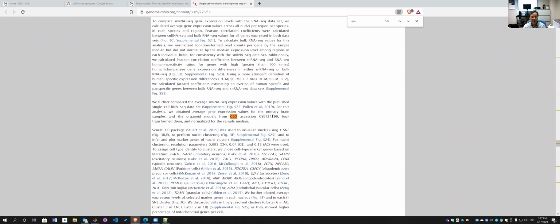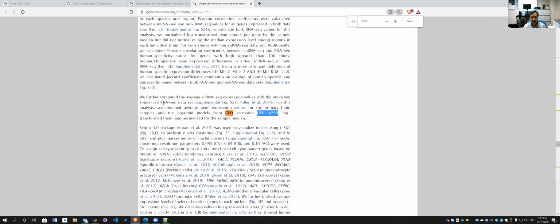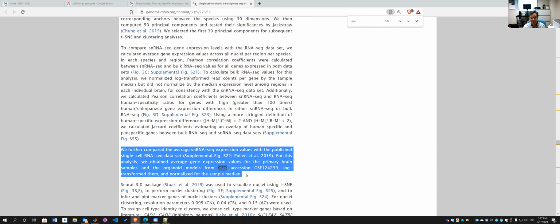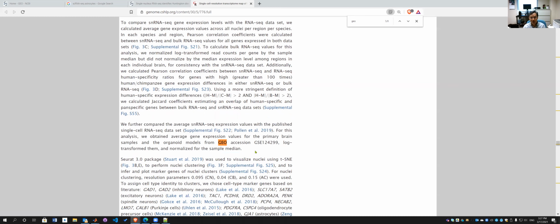Okay, I found this ID. And so this is called single nuclear. It's similar to single cell, just slightly different preparation, because the astrocytes or central nervous system neurons are too sensitive to the damage of the cell preparation.